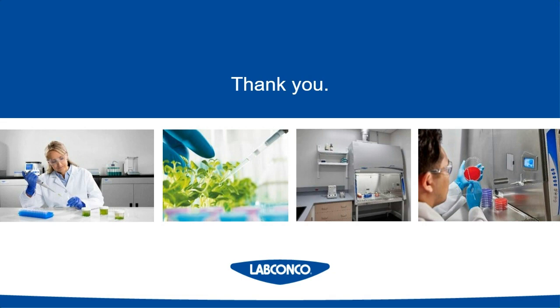Excellent, thank you. Our next question here touches base on that last slide. It says, what is a Class II A2 or A/B3? Okay, that's a great question. So as NSF and the organizations that regulate biosafety cabinets, as safety standards have progressed, some cabinets are no longer made.